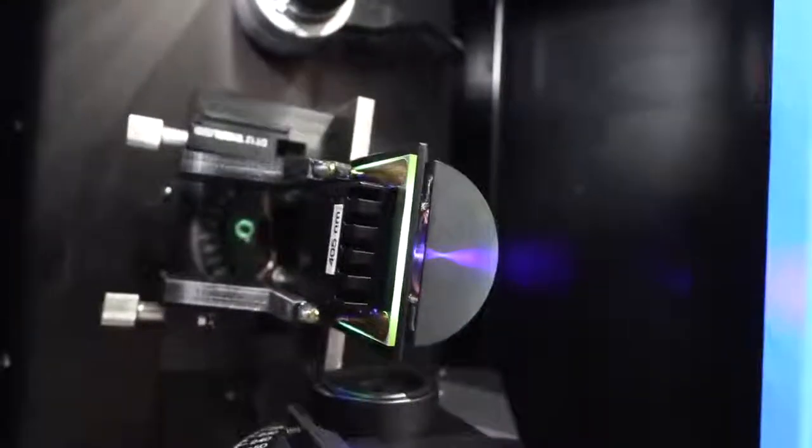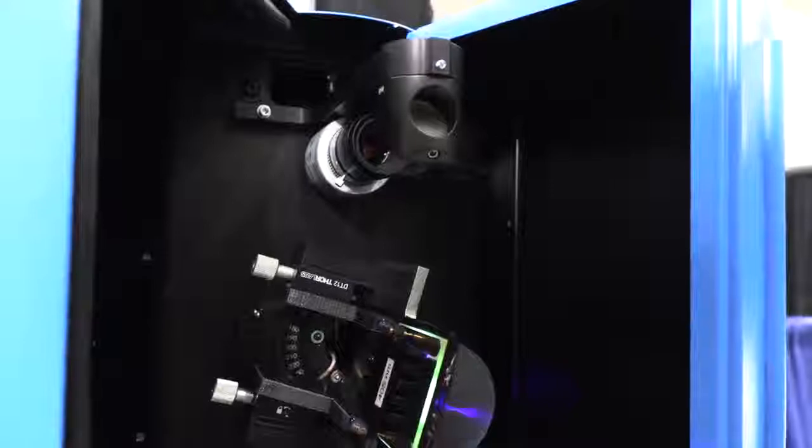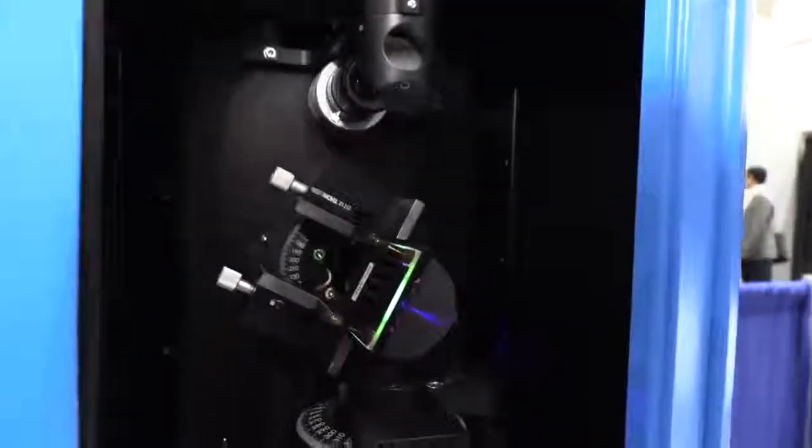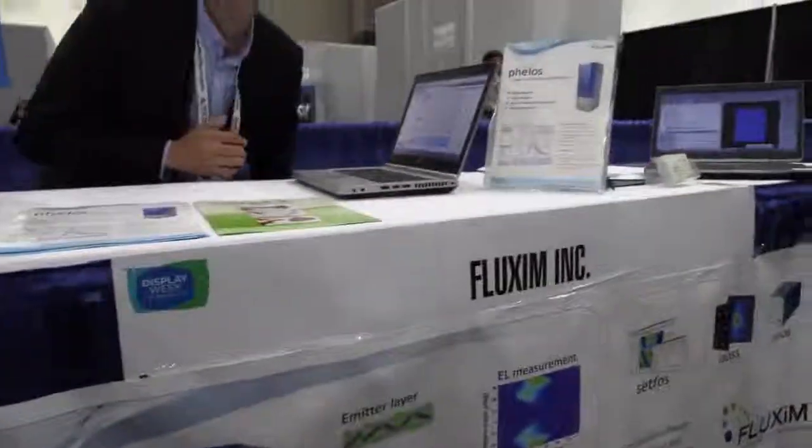So now the Phelos instrument will measure the angular dependence of an OLED emitter film, where we excite with blue light, and the green is the photoluminescence that is measured versus viewing angle. So right here with Fluxim.